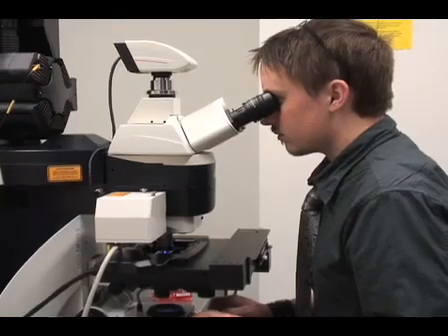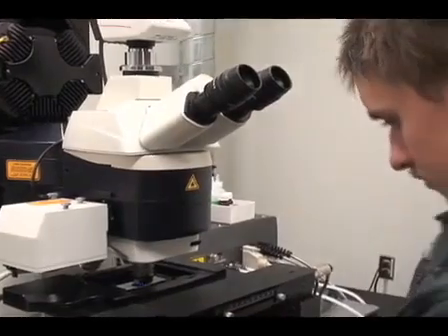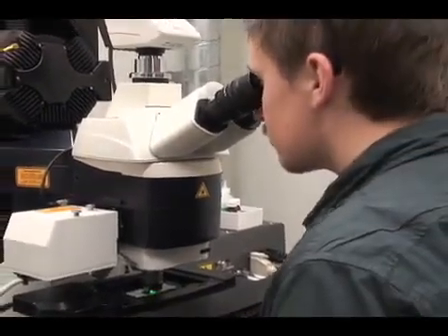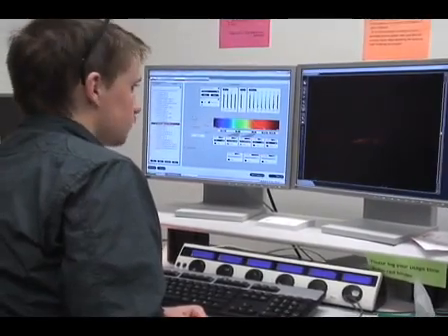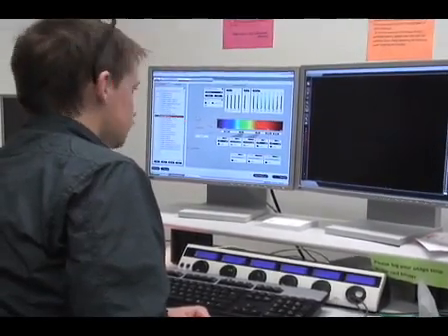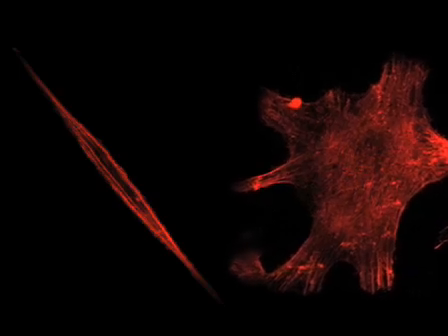Cells stained using the actin dye phalloidin were imaged using the Leica TCS SP5 multiphoton confocal laser scanning microscope at the Advanced Analysis Center at the University of Guelph. This revealed changes in morphology between infected and non-infected cells. Those lacking RAC1 appear elongated and thin compared to the wide, flattened cells that were not infected.